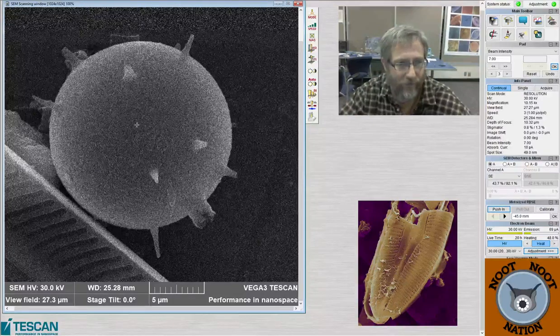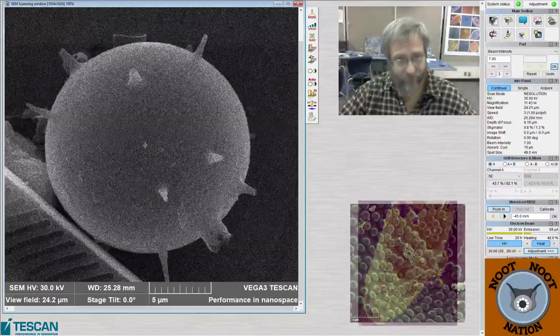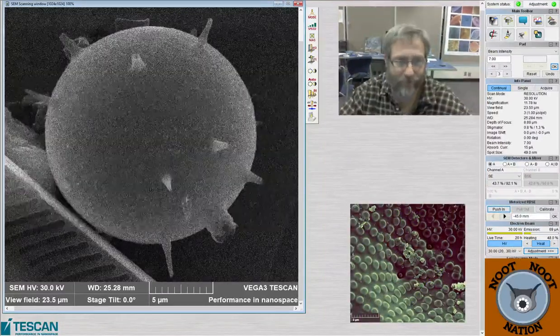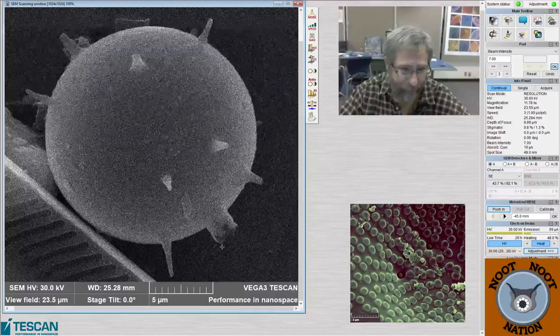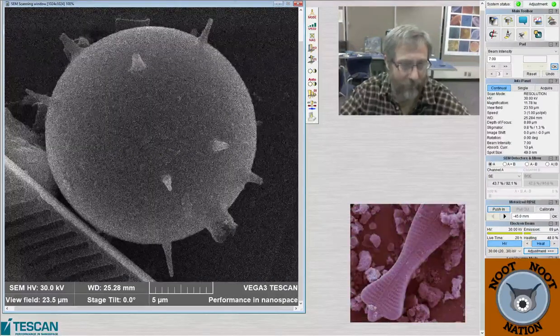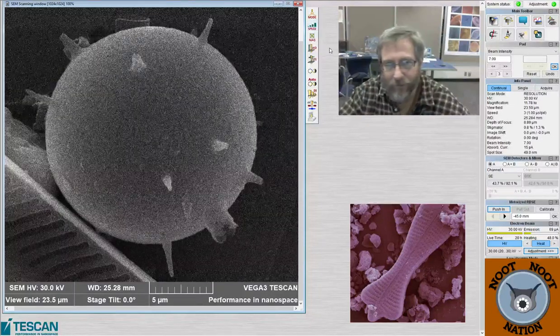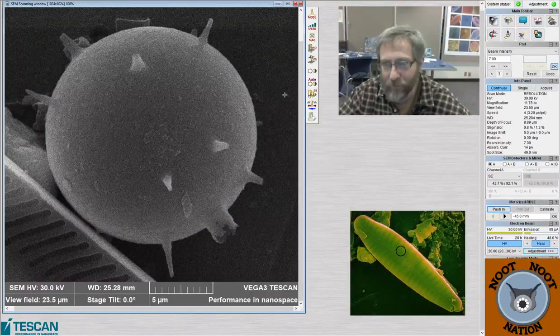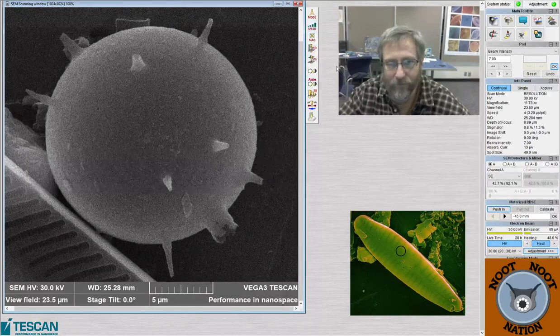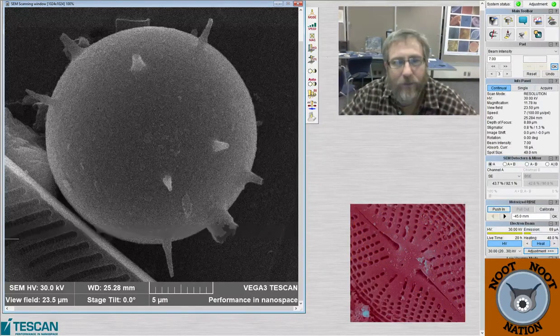So we're looking at a chrysophyte stomatocyst right now. It just looks like a balloon with spikes coming out of it. I like to think of them as Christmas tree ornaments because this one has a little opening, this is where the ornament hanger would go, right? A hollow opening called an aperture or opercula that the organism would crawl in and out of. They would usually climb in here, hibernate for winter, and then come out again in the summer or the spring, probably. So it's a way for organisms to persist through winter conditions.